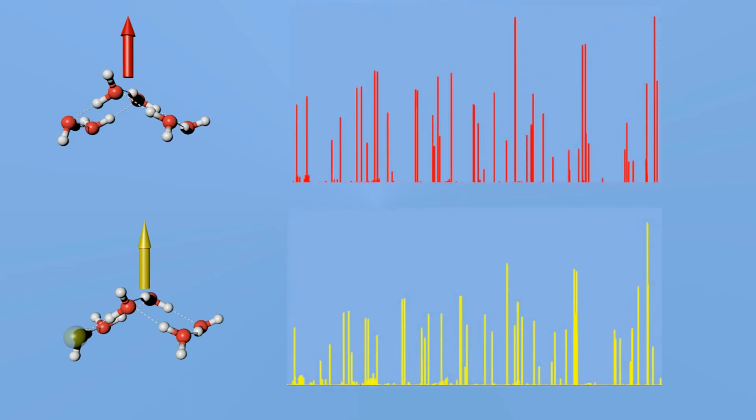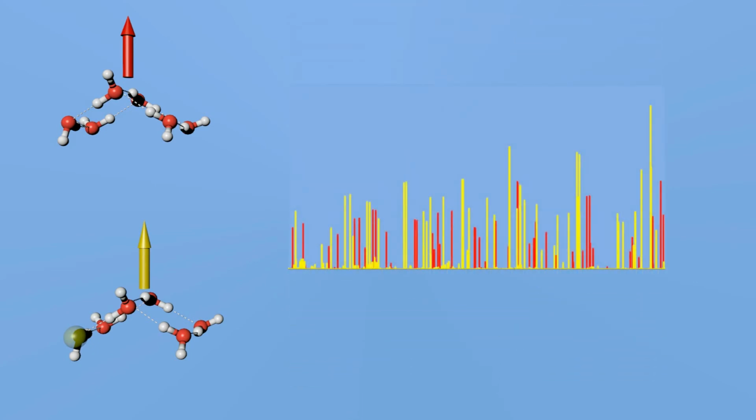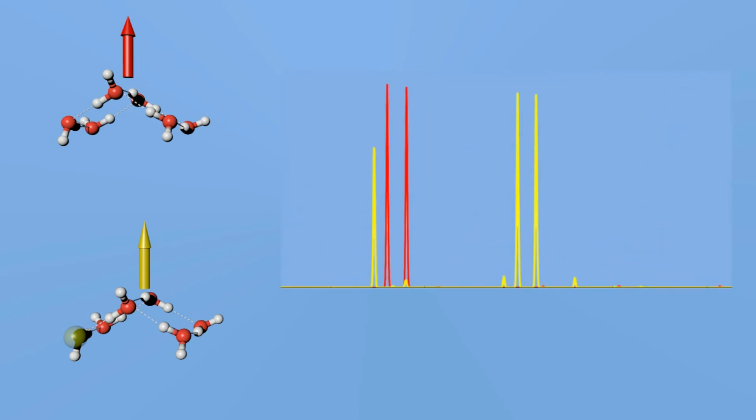Thus we can collect the spectrum of the cluster, and after fitting the shifted spectrum, we can determine the three-dimensional coordinates of the substituted atom by using Kraitchman's equations. This can be repeated for each of the atoms to find a full three-dimensional structure.